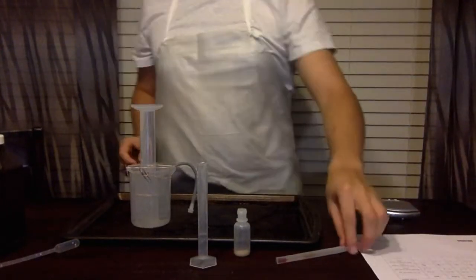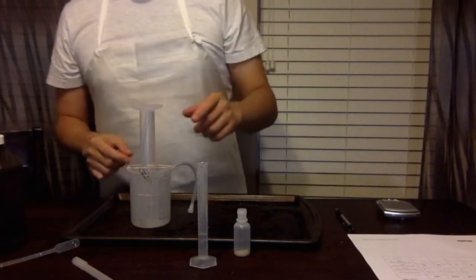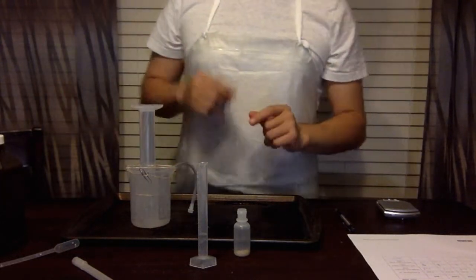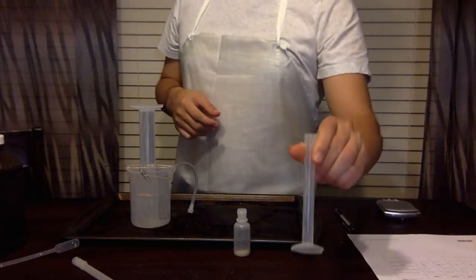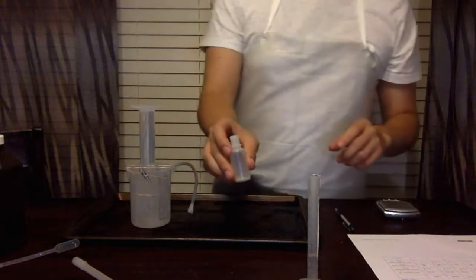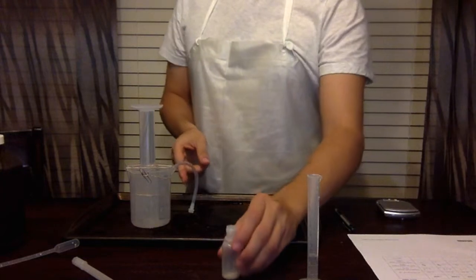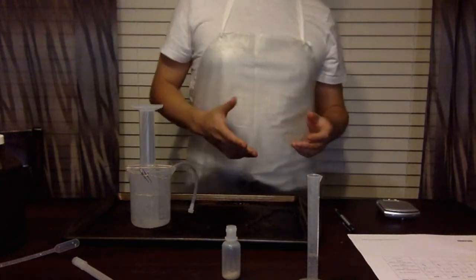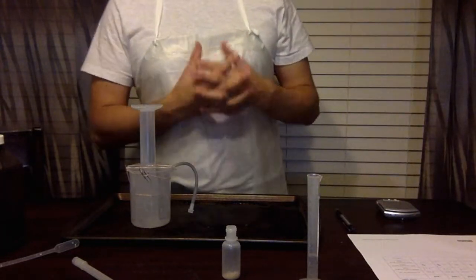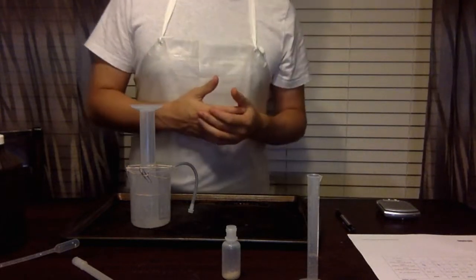Here we have our thermometer, our graduated cylinder, which you'll notice is inverted in our 200 milliliter beaker, and I'll explain that in just a minute. Our 10 milliliter graduated cylinder, we will need our 15 milliliter bottle, which contains a little tip that I've attached to the plastic hose. As you can see, I've already done some preparation prior to shooting this video, just to make things a little easier, since we actually have 8 trials that we have to run through.